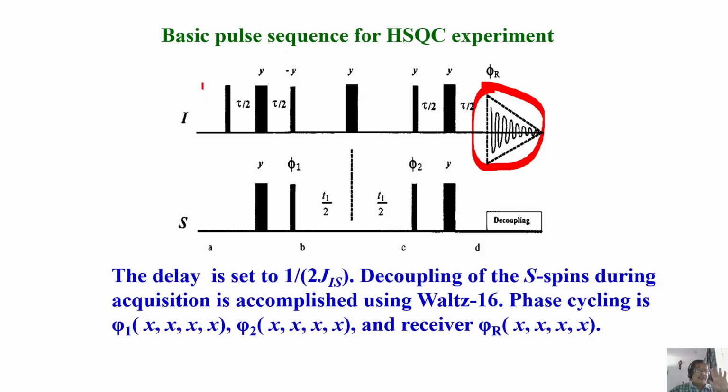You understand the basic pulse sequence. We have already discussed the INEPT sequence by vector diagram; you can continue to do that. Or if you don't worry about how magnetization behaves, the spin physics, don't bother. Please remember, in this block we take the magnetization of proton and give it to carbon.